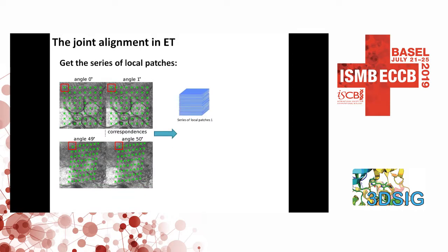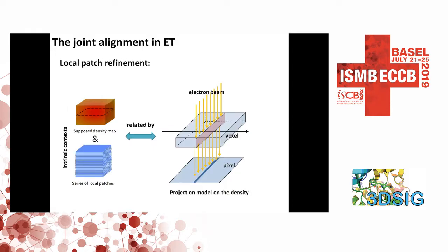Then we got a series of local patches. We got a series of local tilt series. This local tilt series is not so exact, is not so exactly solved. So we should resolve its parameters.